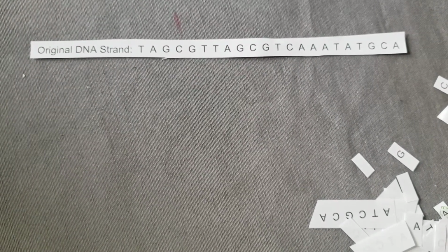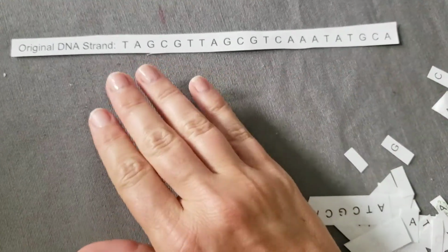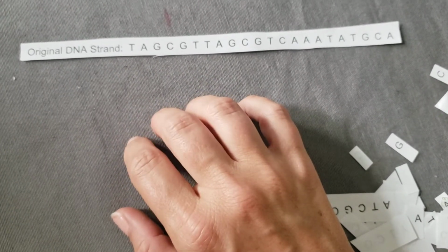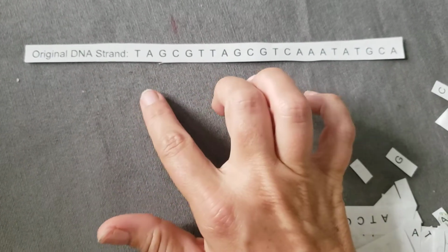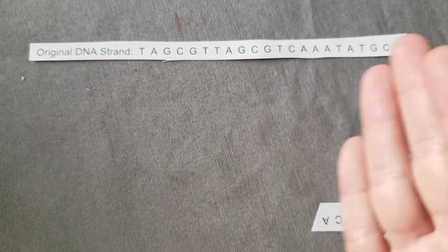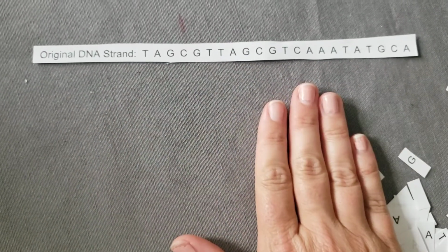And so initially you have DNA in a little tube that would be of an unknown type. Now you have to have some speculation as to what type of DNA you're dealing with. So let's just say we thought that Sue Smith was ill with the flu. So knowing the DNA sequence of the typical flu virus would be a necessity in order to select the correct primers for this process to go down.